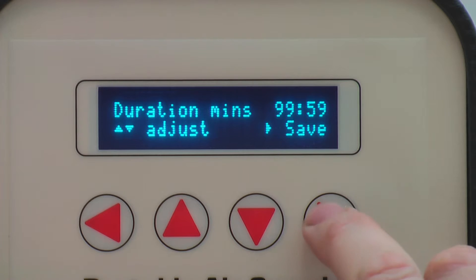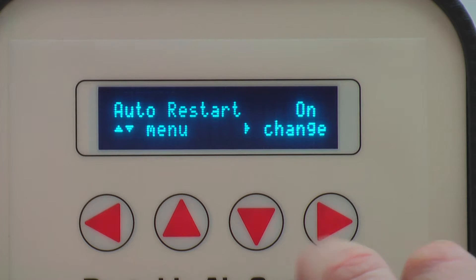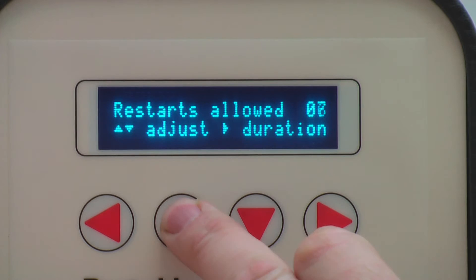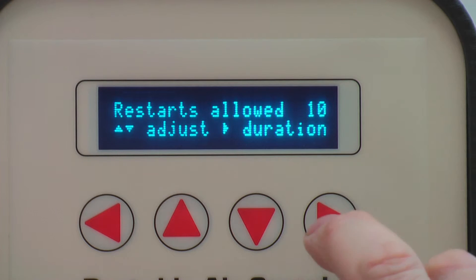Pressing right will ask you to enter the maximum number of restarts allowed before a fault will be registered. Press up or down to decide the maximum number of restarts and press right to access the maximum duration before the fault.